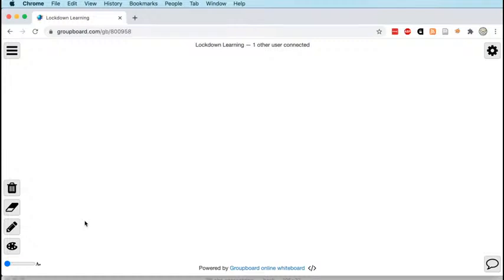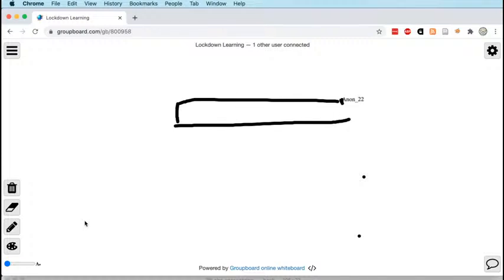So we might talk about that in the future. But alignment is not a straightforward problem, but it is perhaps different to assembly, which is what we're going to think about today.